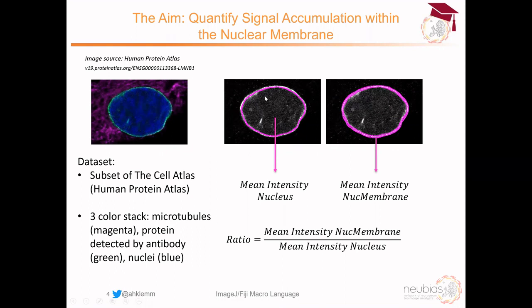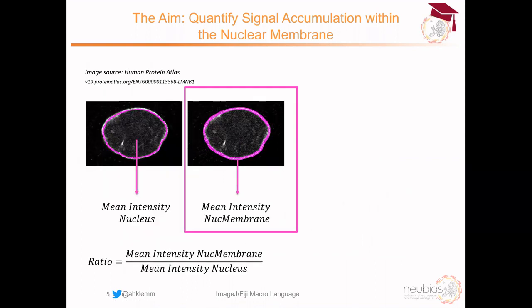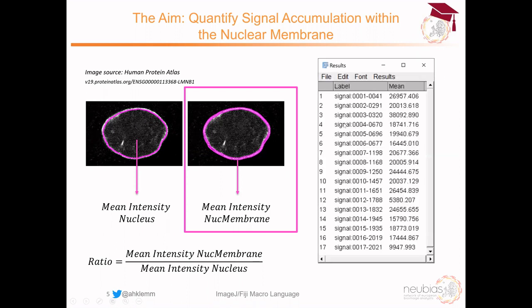What we could do is automatically find where the nucleus is, then automatically find where the nuclear membrane is, then measure the mean intensity in the nucleus and the mean intensity only in the nuclear membrane, and calculate a ratio from these two values. Since this is a course on ImageJ macro writing, we will focus specifically on how to automatically get an outline of the nuclear membrane and how to measure the mean intensity within that selection.